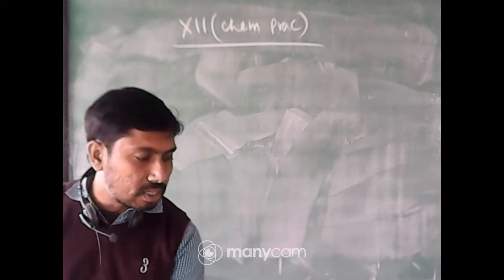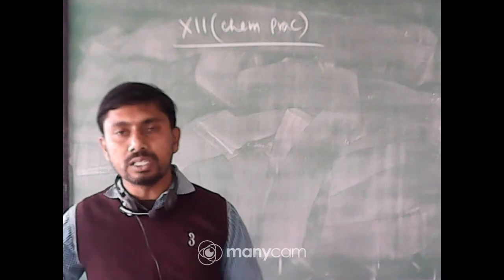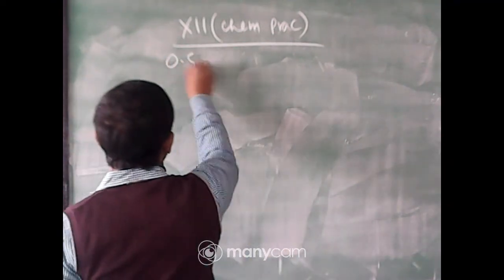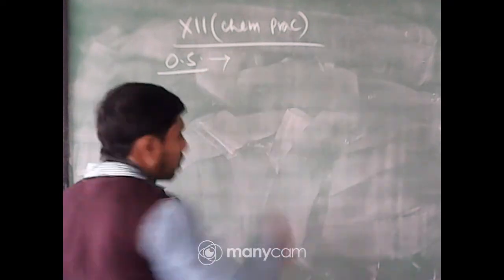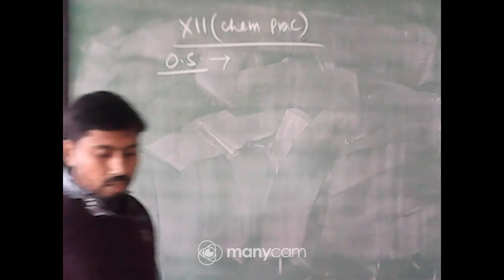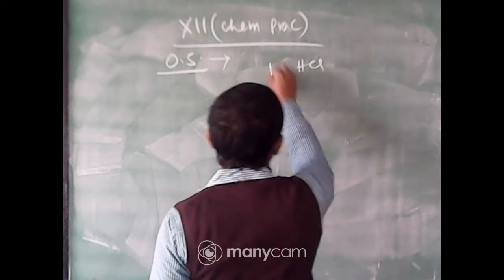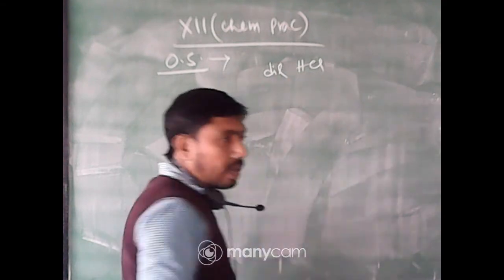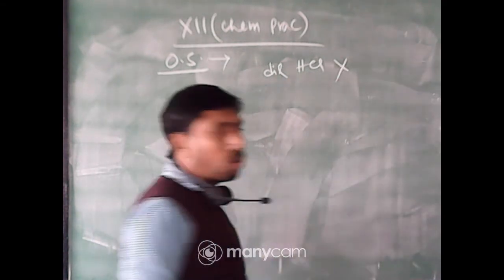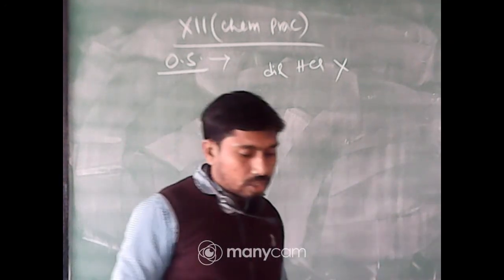Next part is making the solution, that is preparation of OS. Basically these are water soluble. Except water there is also dilute HCl, but this is not included in your syllabus. So only the aqueous medium is the soluble medium.